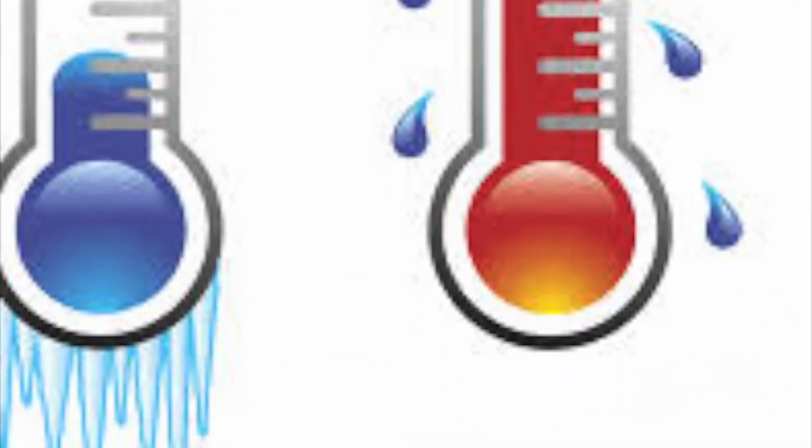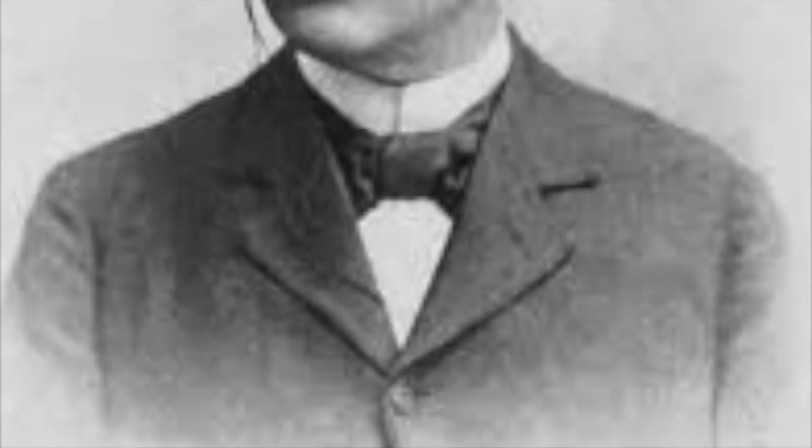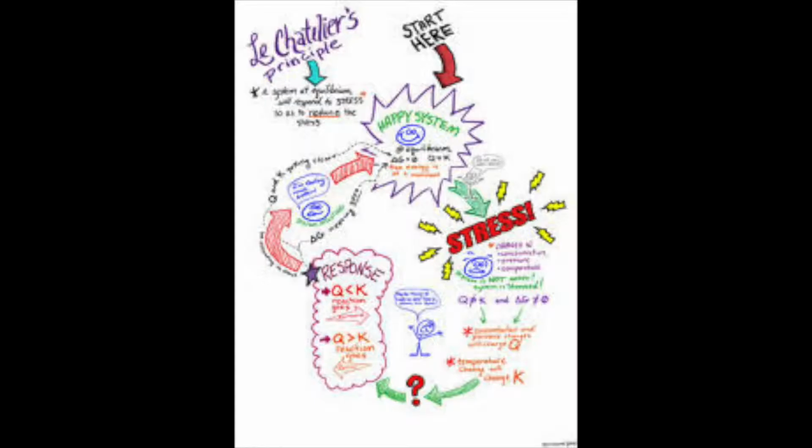When we changed the temperature, there was no change in the system. Change in temperature did not affect our solution. According to Le Chatelier's principle, if you make a change to the conditions of a reaction in dynamic equilibrium, the position of equilibrium moves to counter the change you have made.